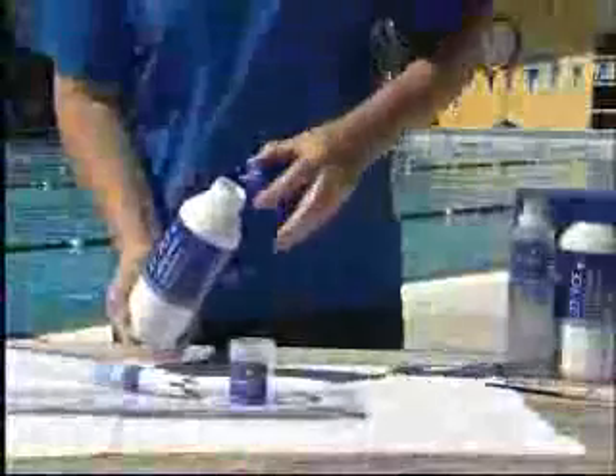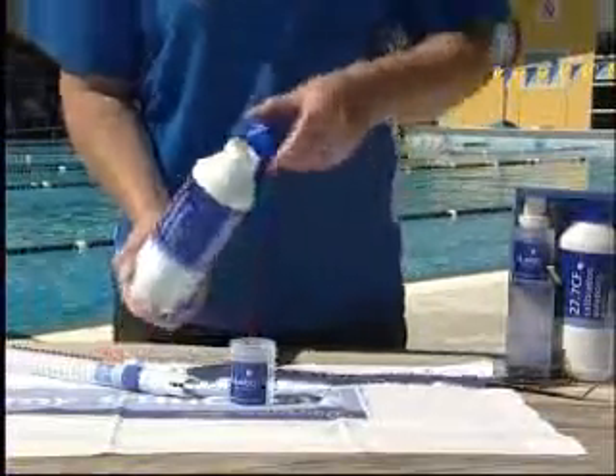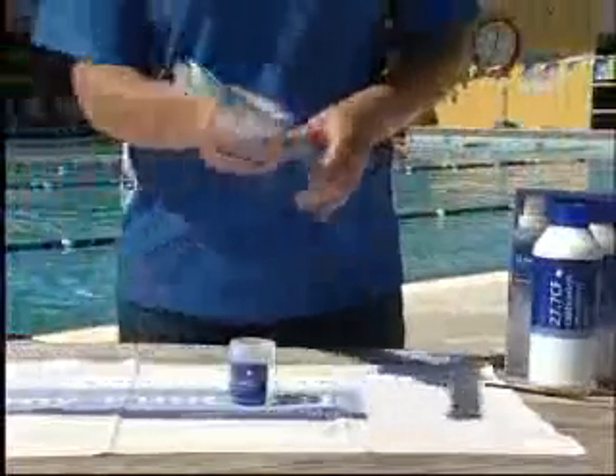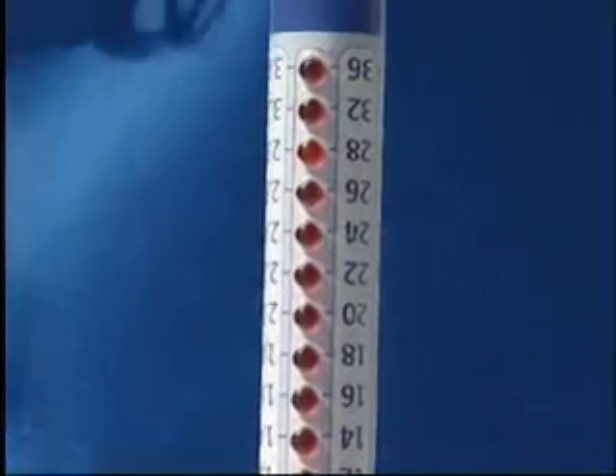Once cleaned and any excess water shaken off, pour some CF27.7 standard solution into the clean and dry decanter vessel. Submerge the probe into the vessel. The light will flash on 27, 28, or 29. The accuracy of within 1 CF is acceptable.